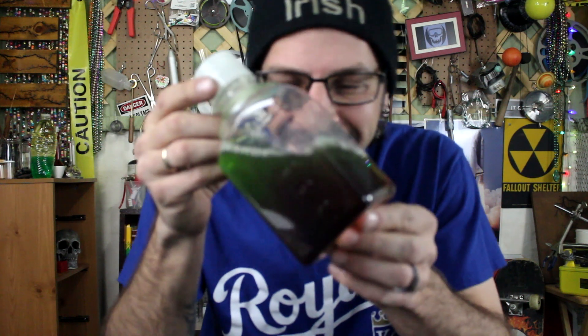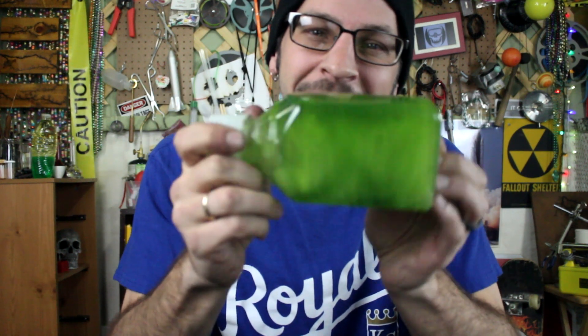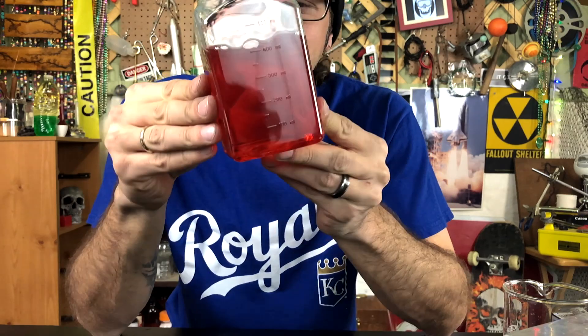It's so green, and then it's so red, but then it goes right back to being so yellow. Man, that's just super cool. Yellow and red and even green. Now that is some beautiful science.